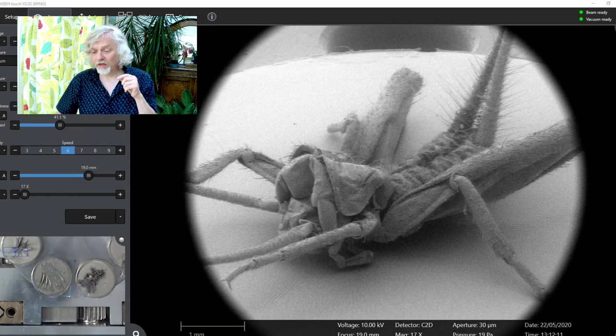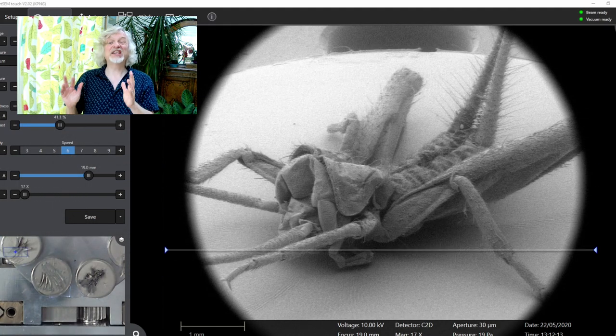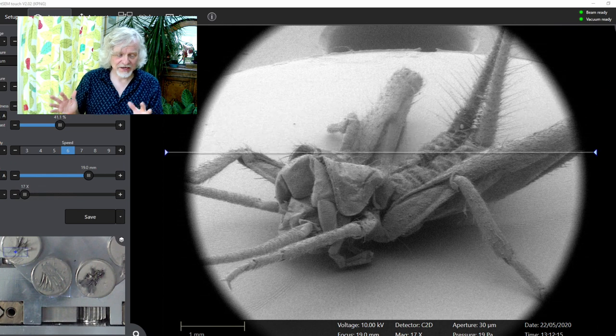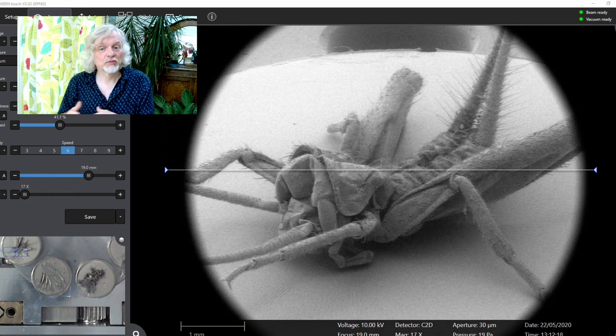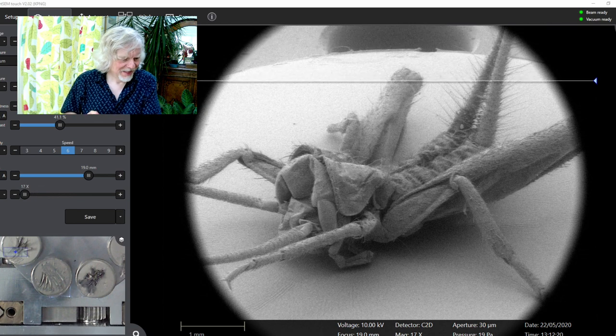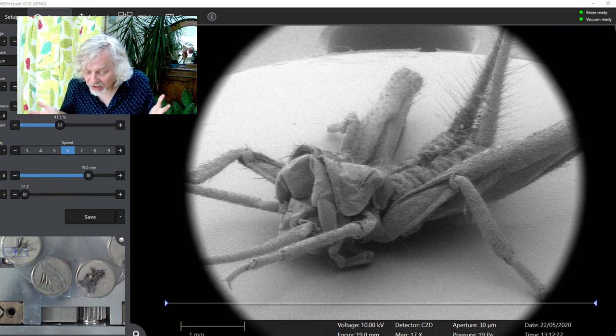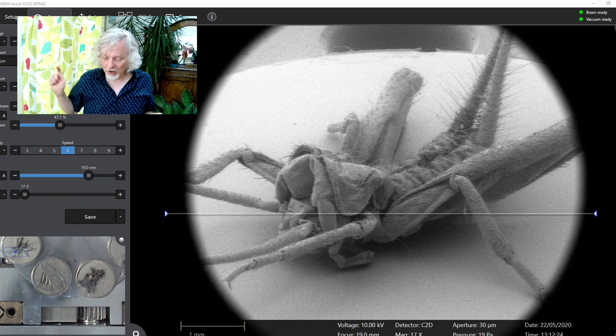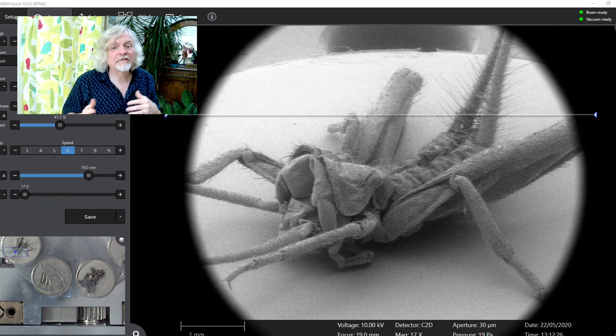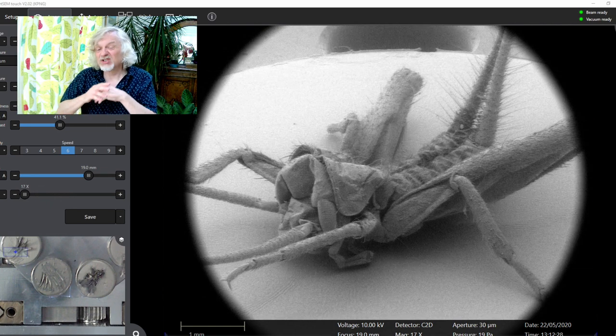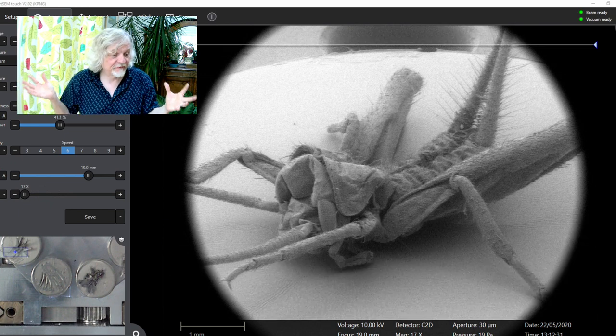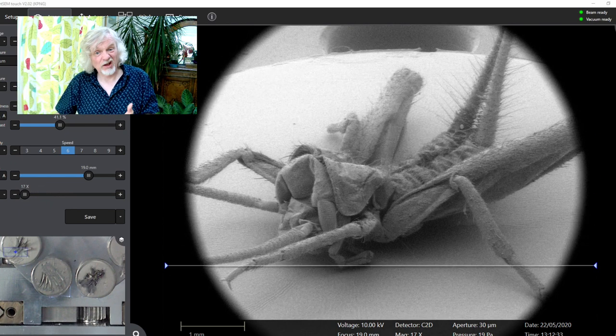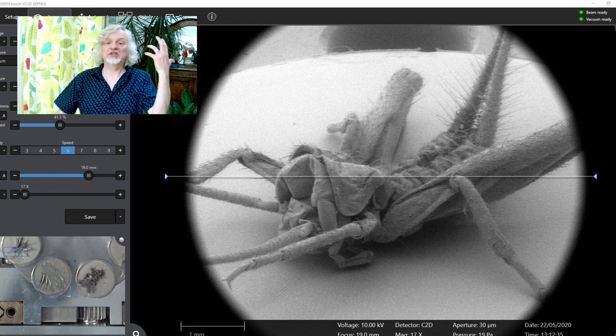And what this is showing me at 17 times magnification is the little house cricket that was bought from a pet shop. It's the house cricket Acheta domesticus, I had to look that up. Southwest Asian native, but sold in pet shops all over the world now as food for things like lizards and snakes and stuff like that.